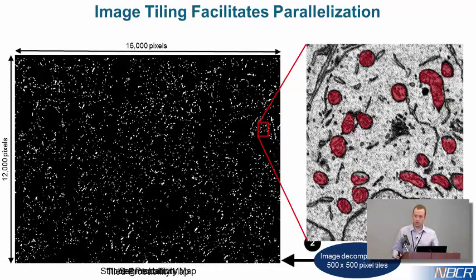Yeah. So, do you always manually segment at the highest pixel resolution, or does it depend on a case-by-case basis? The highest what? The pixel resolution, for example, like mitochondria, right? You use the downsample by 2, or for nucleus, you do a manual segmentation at downsample by 2.